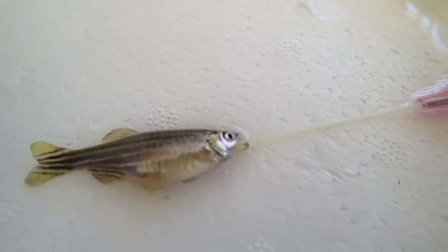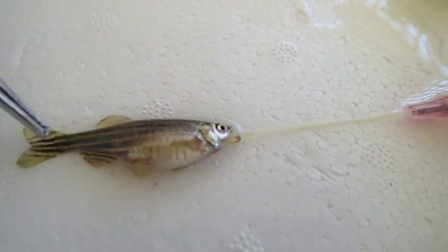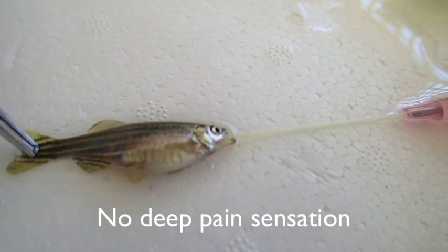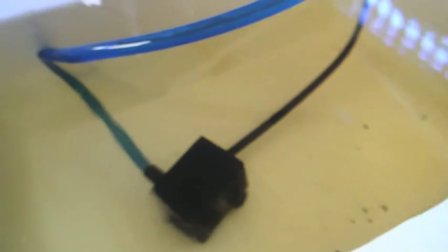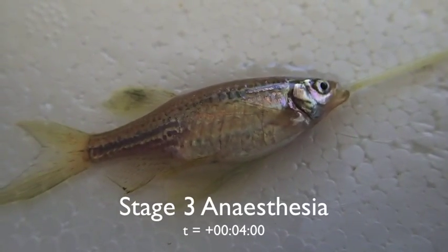Here's the fish at 2 minutes on the circuit. You can see that deep sensation, or deep pain sensation, is much reduced. And just demonstrating the reservoir below, which is just a water pump in the anesthetic circuit.